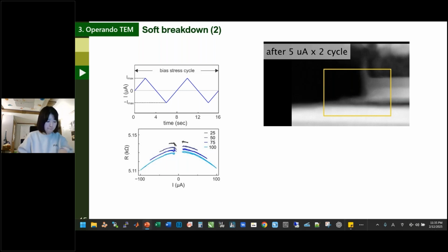Are you okay doing some multitasking while you're reopening the file? I'll see if I can ask you a question that came in. We have one question that says she was wondering about the electrical behavior of the carbon protective layers deposited during the FIB preparation. Are they not electrically conductive, and how does that influence your measurements?